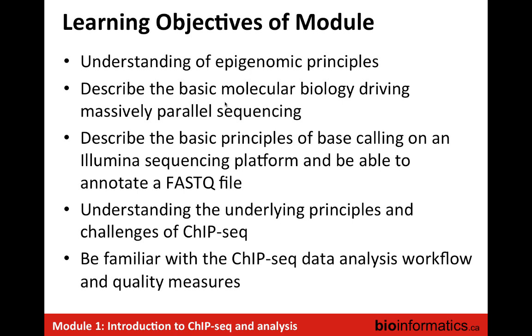Of course, that is the output of a sequencing instrument, and that goes into the downstream analysis. I'm going to then go through some challenges and some of the underlying principles of ChIP sequencing, and these are applicable both to histone modifications as well as to those of you who are interested in transcription factors. I heard CTCF mentioned a number of times. Then I'm going to go through a very high-level overview of the analysis workflow. And then in Module 2, we're going to get into more detail in terms of the alignment.